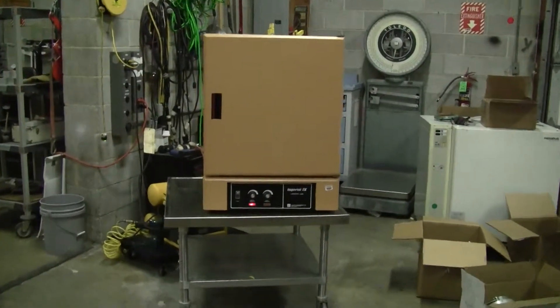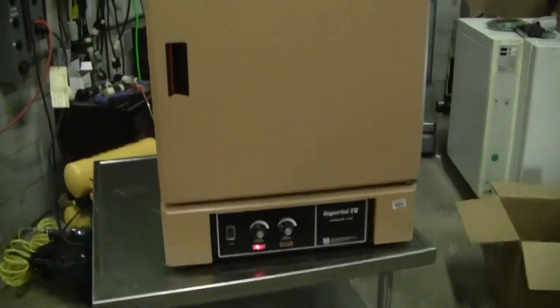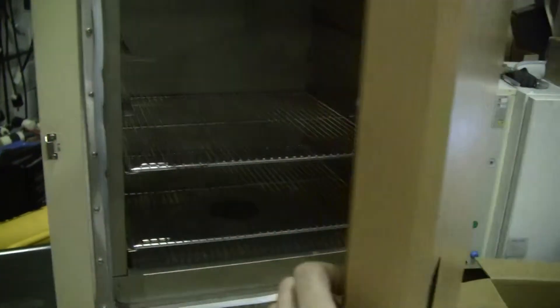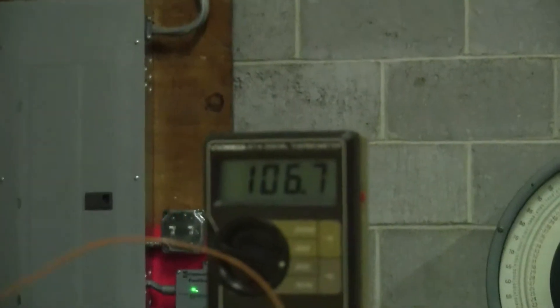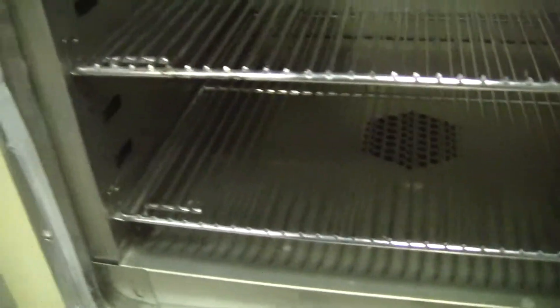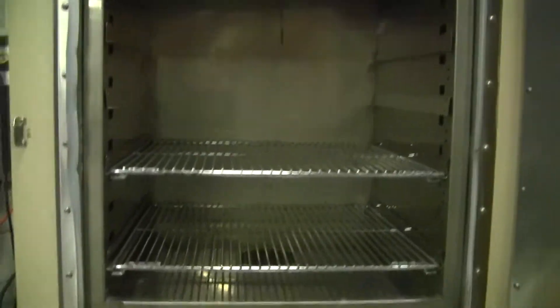There are two racks inside this oven. This is a mechanical convection oven. Let's take a look at the inside. Nice and clean on the inside — there you see the two racks. Here's our thermocouple in there. Even after opening the door, we're still over a hundred degrees C — nice and hot in here. Nice stainless steel. You can hear the fan running nice and smoothly — this forced air oven helps ensure even heating through the whole chamber.